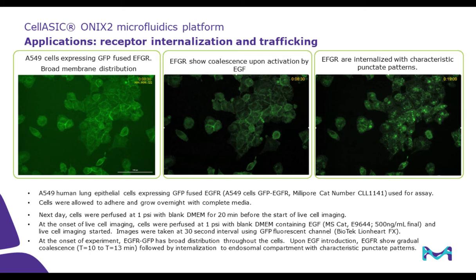Next, we are looking at intracellular trafficking of proteins. In this case, we are examining internalization of fluorescent EGF receptor upon EGF activation. You will notice upon the addition of EGF, the receptors start to coalesce together, which then gets internalized to enter a compartment with characteristic punctate patterns. Let's take a closer look with the live cell movie.